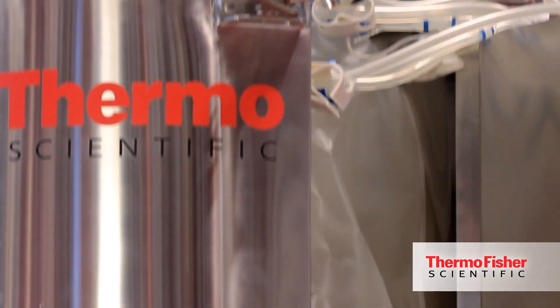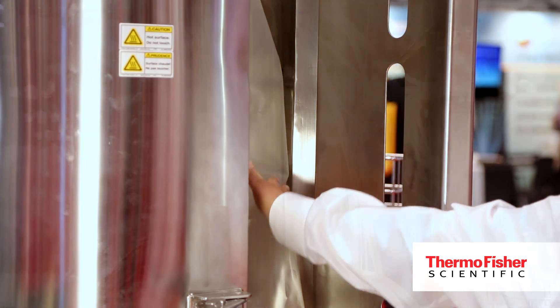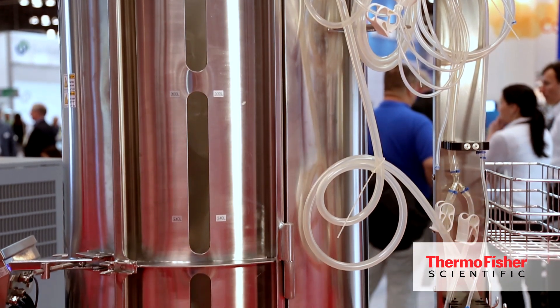Since this needs rigorous mixing, we have baffles in this. And when the bag goes and sits like this, it provides a good amount of disturbance and creates a good amount of mixing.